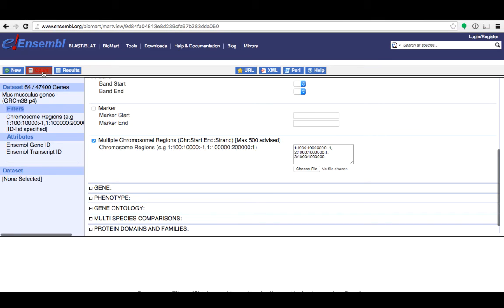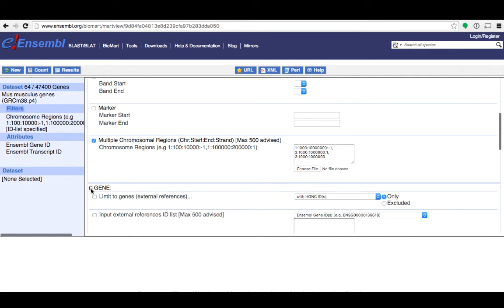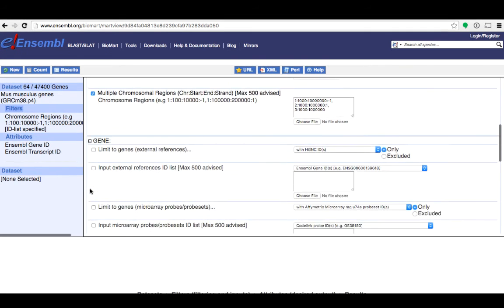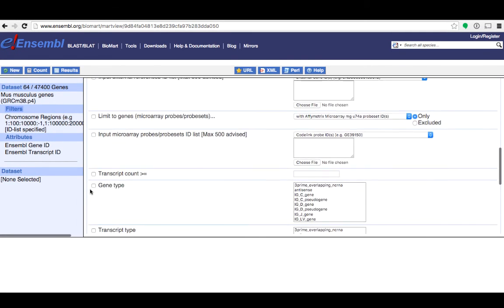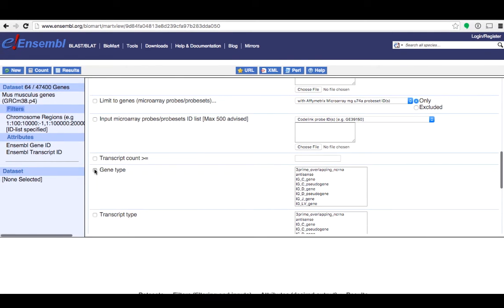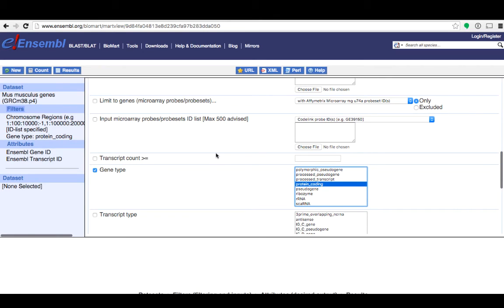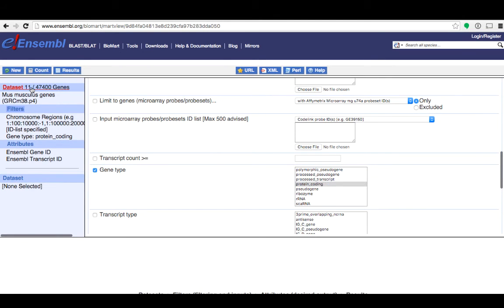I will now click on count to see how many genes are within these regions. This shows me that there are 64 genes lying within the genomic coordinates I've selected. Now I'm going to narrow my search to only include protein coding genes. I'll expand this gene option and scroll down to gene type. Then I'll find protein coding and select that. If I click on count once more I'll see how many protein coding genes I have within my selected genomic coordinates. And here you can see that there are 11 protein coding genes there.